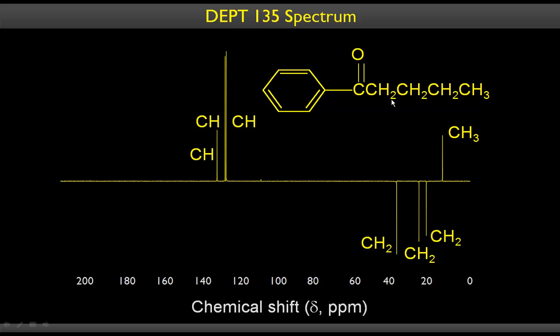There are three methylenes, and these methylenes are here, and there are three different chemical shifts. One of them is adjacent to the carbonyl, so that is pretty downfield compared to the rest of the two. In other words, this is de-shielded compared to these two. Any questions? If not, we'll move forward. If you have questions, please revise the slides or stop by and see me.